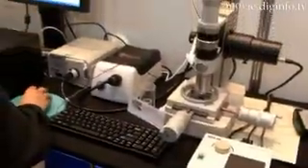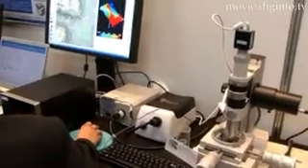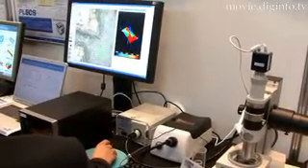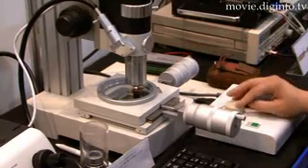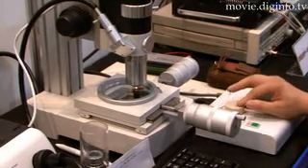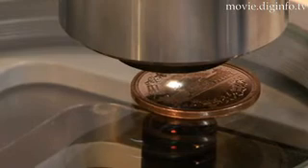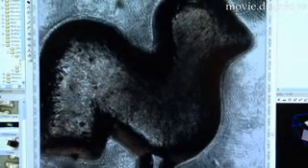The TVU Digital Microscope is a fully integrated, built-to-order system for observing, recording and analysing objects on a submicron level in real time. The microscope features a 3 megapixel CCD and a magnification ratio of approximately 8000 times.